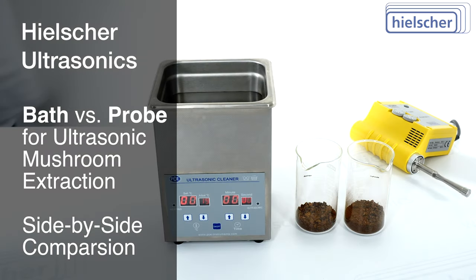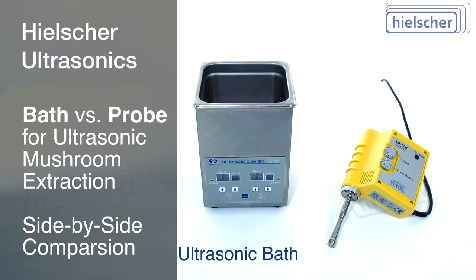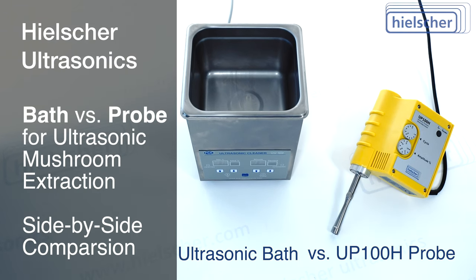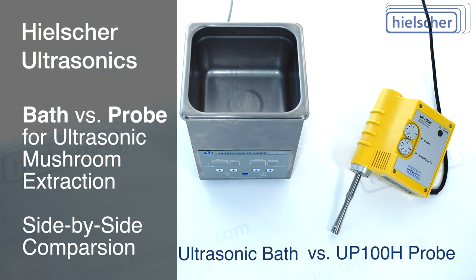In this video, we compare the extraction power of an ultrasonic bath, also known as an ultrasonic cleaner, with that of a Hielscher UP100H ultrasonic probe.